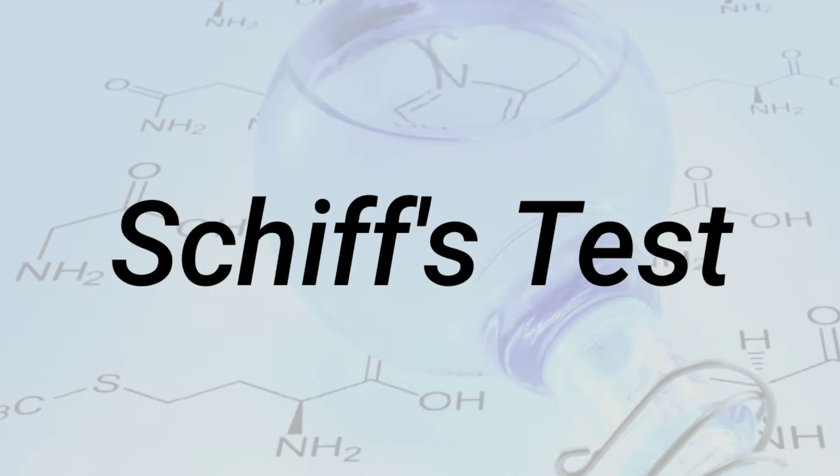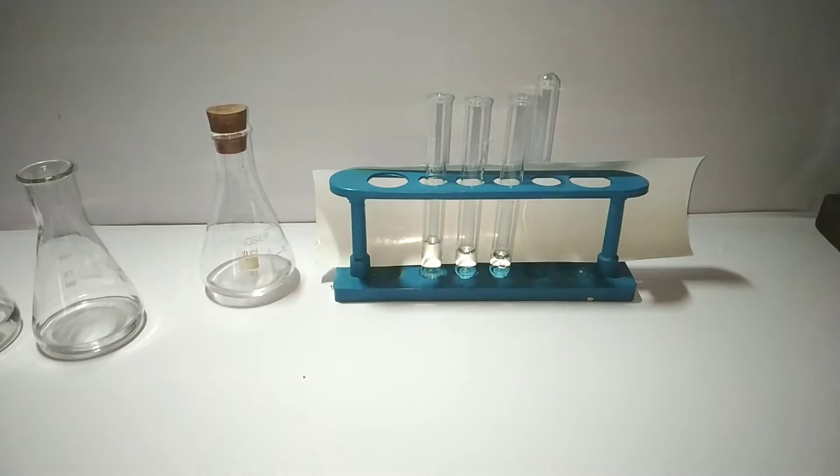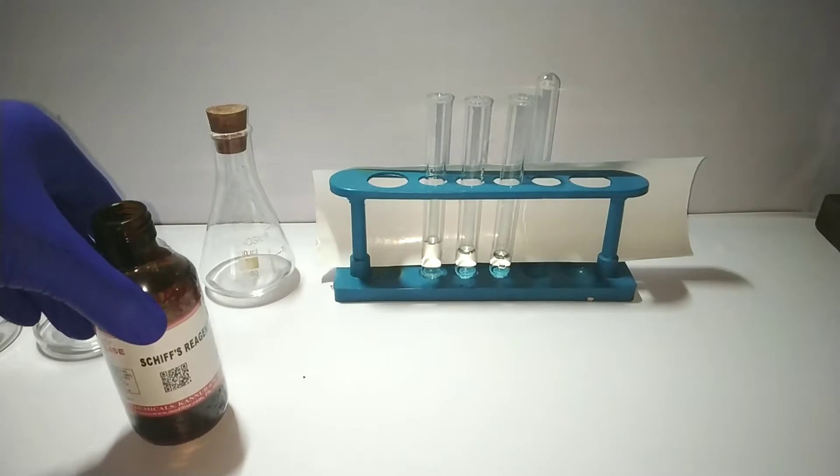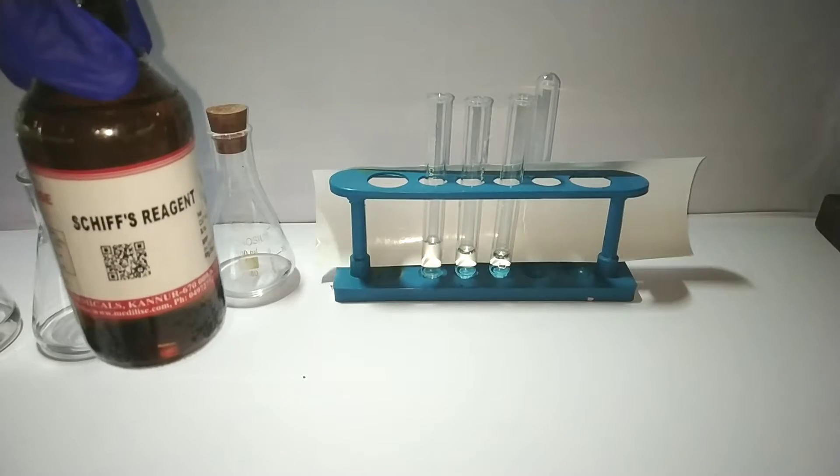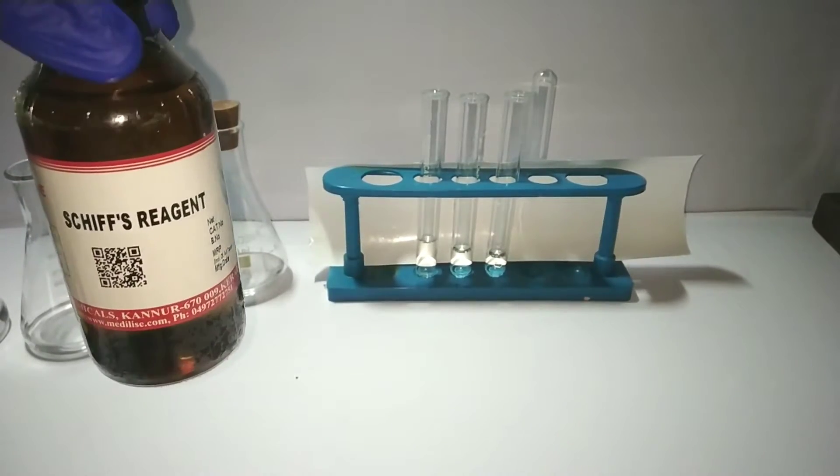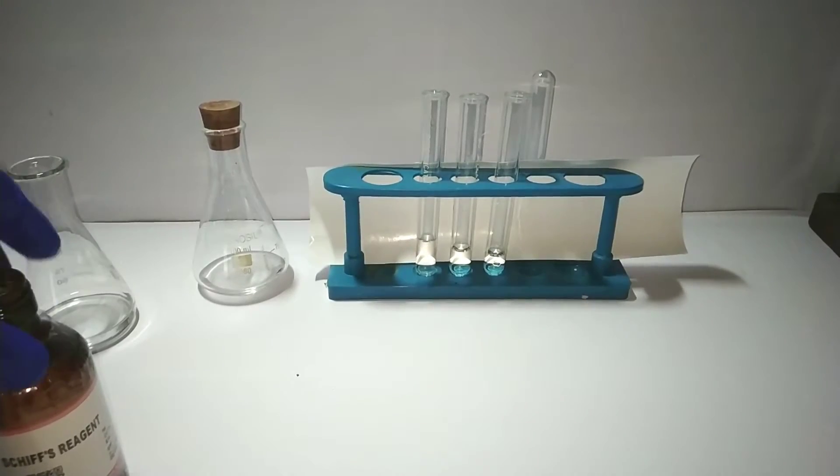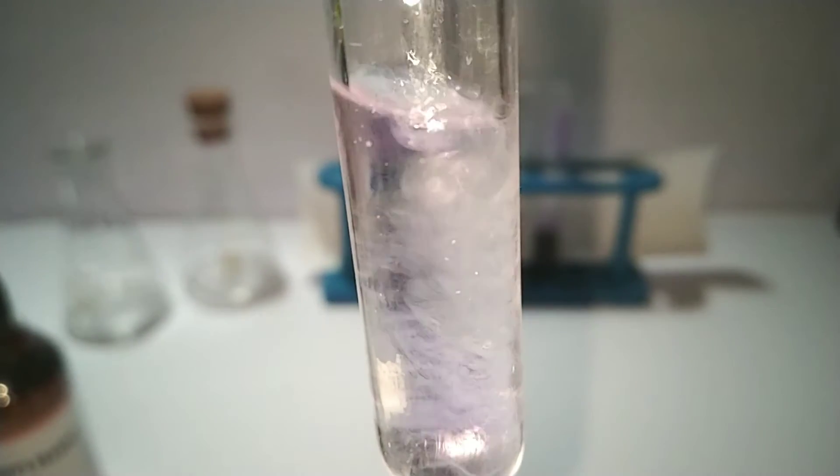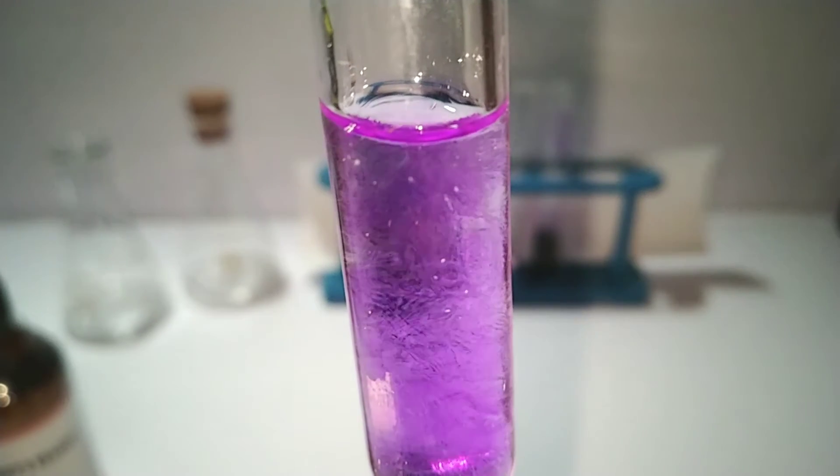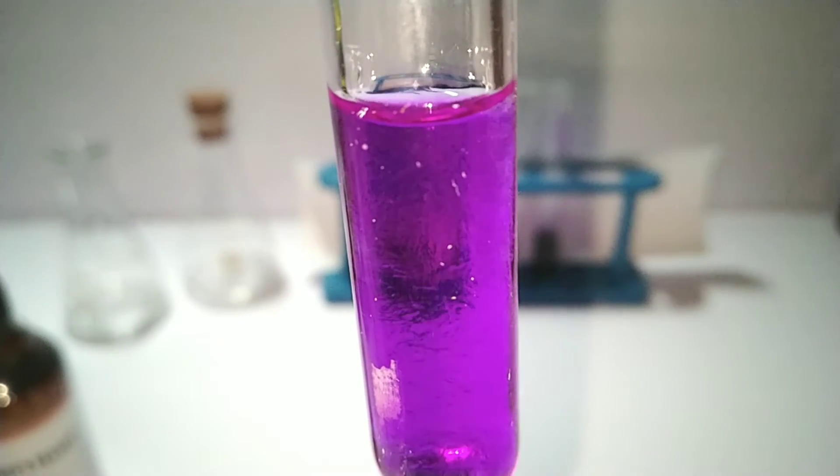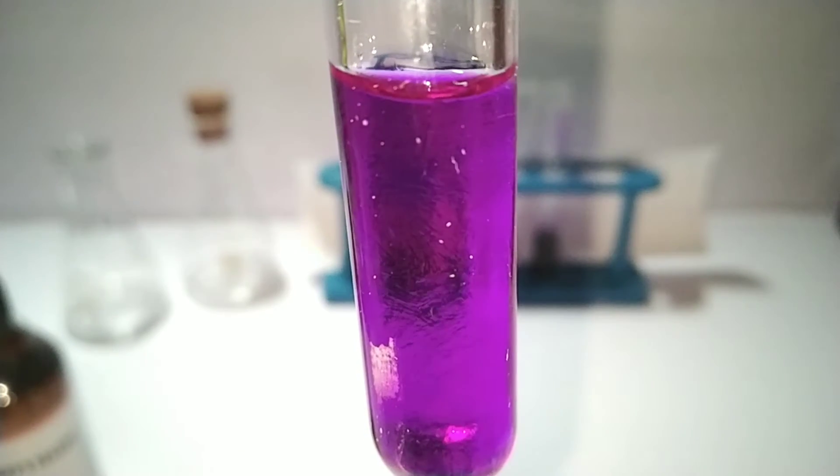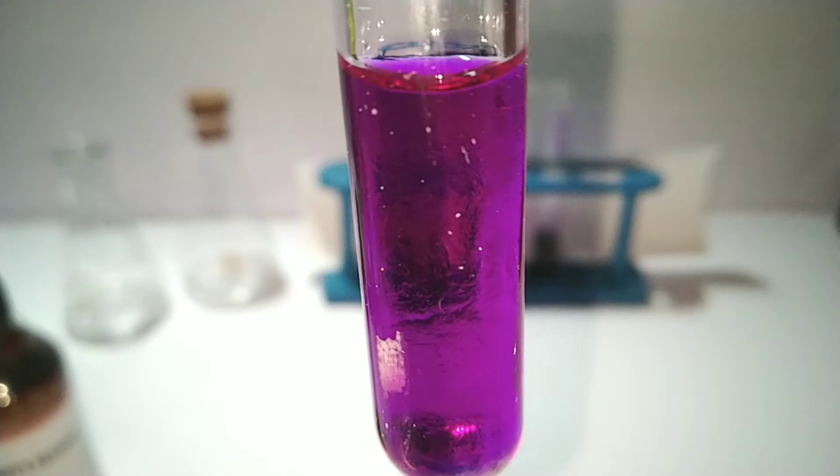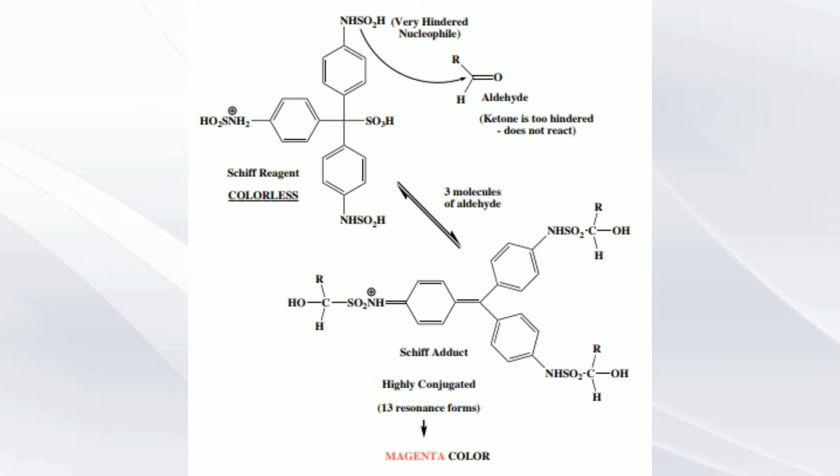It is also a specific test for aldehydes. Schiff reagent is an aqueous solution of para-rosaniline hydrochloride dye, which is decolorized by adding sodium sulfite. The para-rosaniline reacts with bisulfite to form decolorized adduct. When Schiff reagent is added to the organic compound, a pink color is obtained. When aldehyde groups react with the amine group of the dye, it forms aldimine group. The aldimine group is an excellent electrophile and it undergoes further reaction with the bisulfite ion, forming a purple colored bisulfite adduct. This is the reaction. You can actually see 3 aldehyde groups react with the 3 sulfonated amine groups to form the adduct.